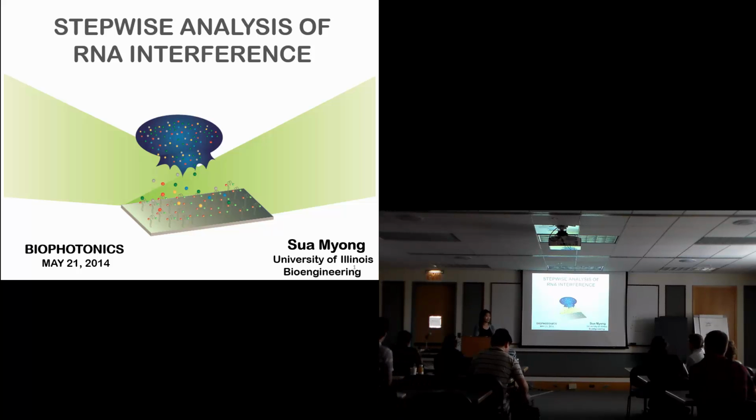So yeah, like Dr. Bopart introduced, I'll be talking to you about molecular imaging, which is probably the smallest scale of imaging that you will encounter. Okay, so yeah, don't pay attention to the topic. This is the biological pathway that we try to investigate using the single molecule technique. So I'll introduce it later on in the talk. First I'll go over the techniques, how the assays run, why we do it, and how we achieve the molecular imaging. That'll be maybe the first third of the talk, and then I'll go into more biological applications of how we use this tool to study a biological pathway, which is the RNA interference pathway.